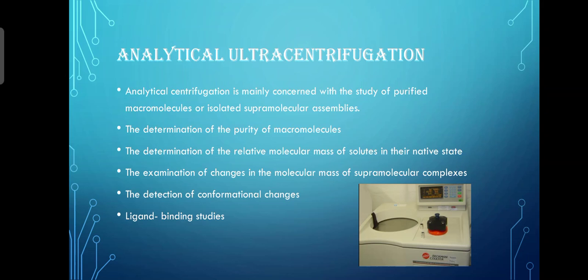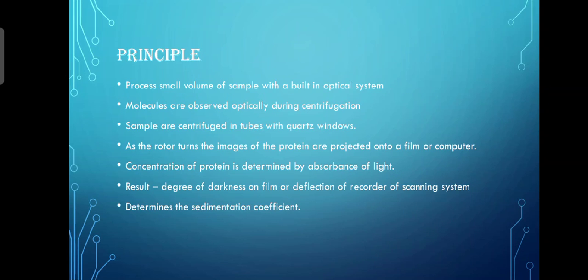The examination of changes in molecular mass of supramolecular complexes. The determination of relative molecular mass of a solute in its native state. The detection of conformational changes, ligand binding studies. The principle of analytical ultracentrifugation.